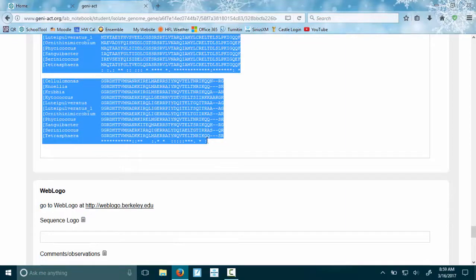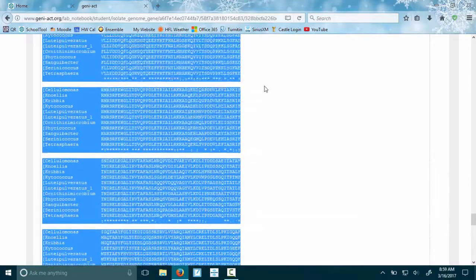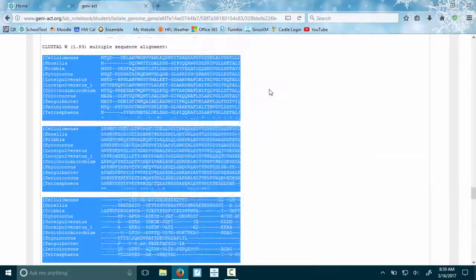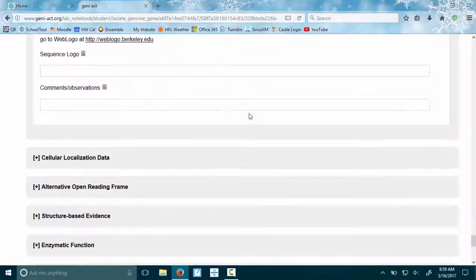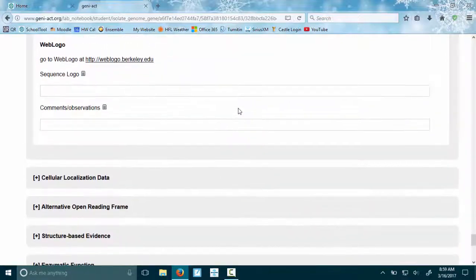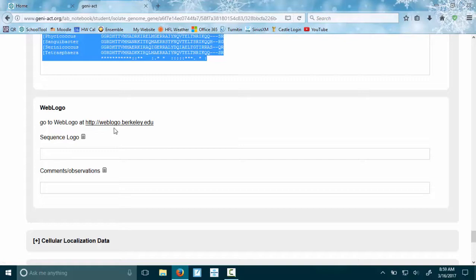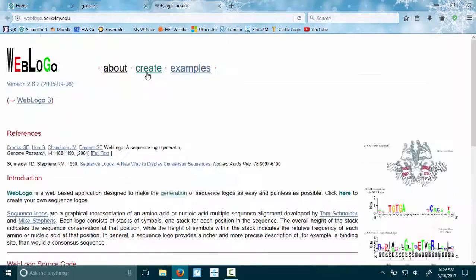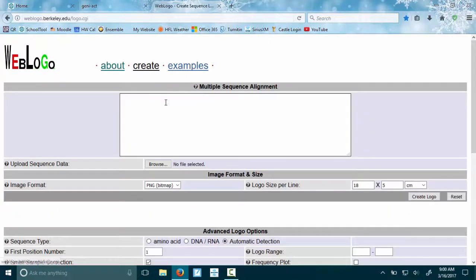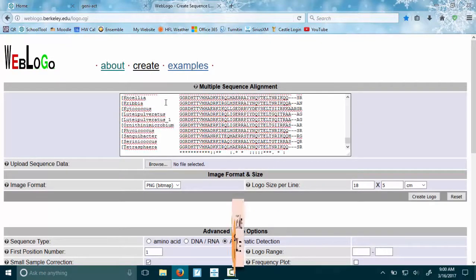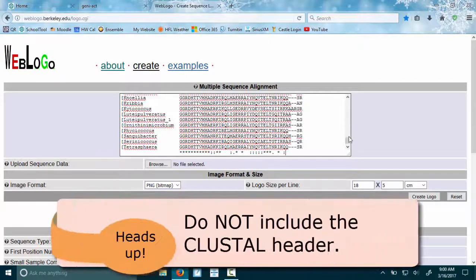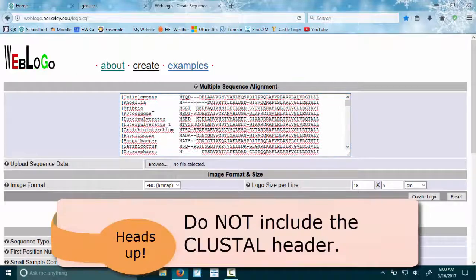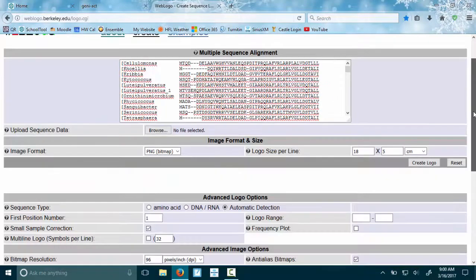Then we need to go to WebLogo, which is here in the next section. So remember, if you Control+Click it will open a new tab. We want to create a web logo, and we're going to paste in the multiple sequence alignment from our T-Coffee section of our notebook.